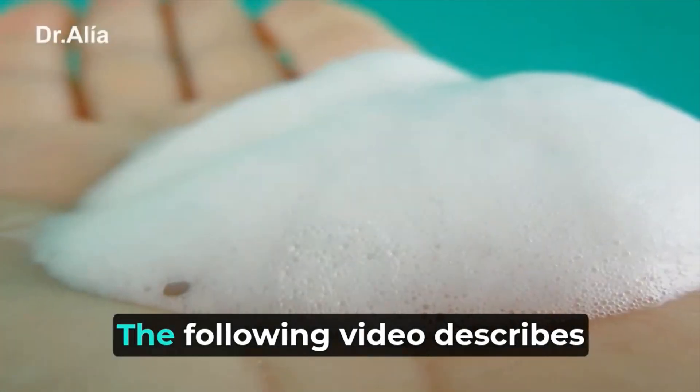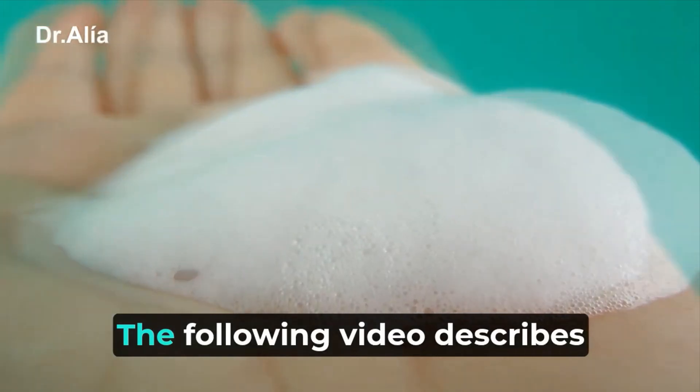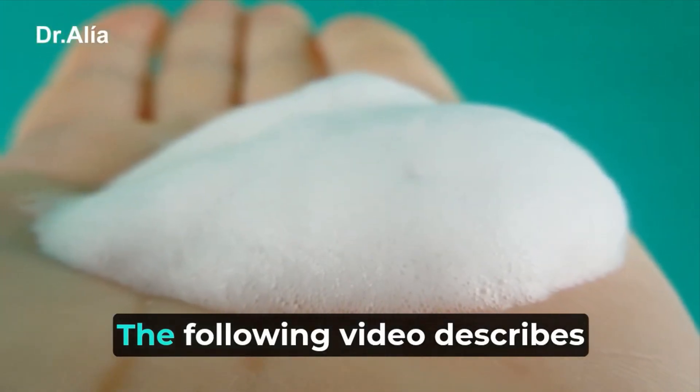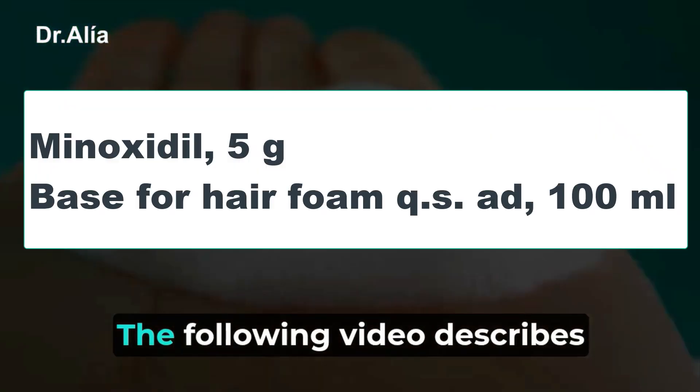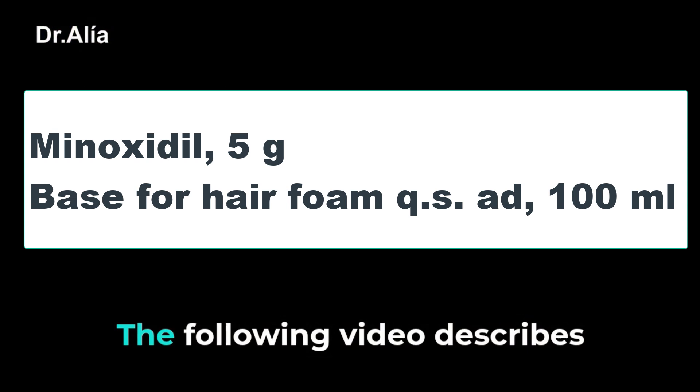The following video describes the process of making a 5% minoxidil foam. The formula has the following composition: minoxidil 5 grams, foam base, quantity sufficient for 100 milliliters.